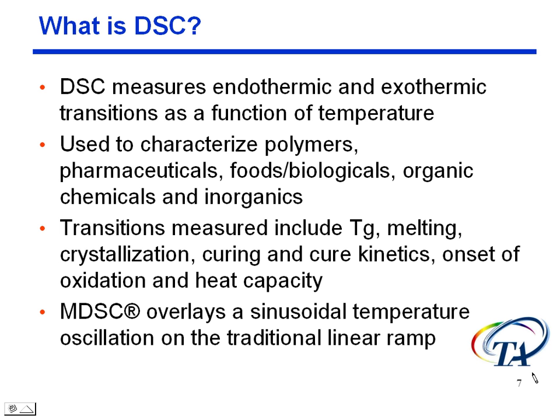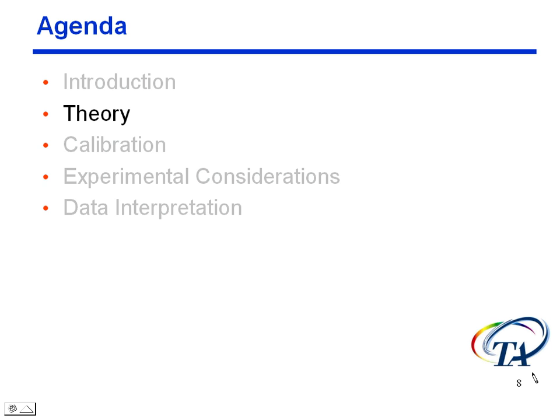Now, modulated DSC takes standard DSC and overlays a sinusoidal temperature oscillation on the standard or traditional temperature ramp. And we'll talk about what that gives us here in just a second. Let's go through some of the basic theory.